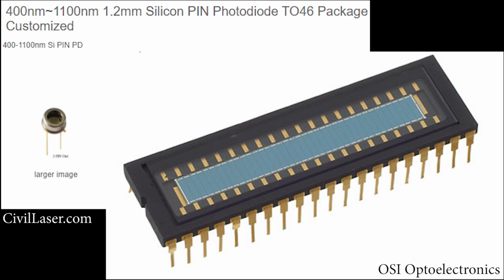If we count each one of those pins, each one of those pins corresponds to an electrode on one of those photodiodes. Looks like there's about 30. And if you look closely, you'll see the individual rectangular pixels. Each one of those pixels is a photodiode. So there's about 30 photodiodes right on that chip. And that's not even a lot. Like I said, it's not that big a deal to buy a photodiode array that has a couple thousand diodes in it.